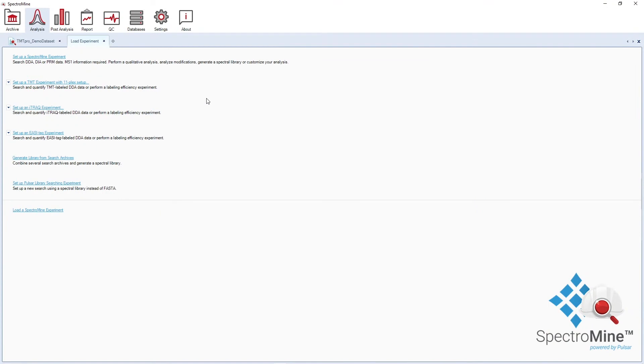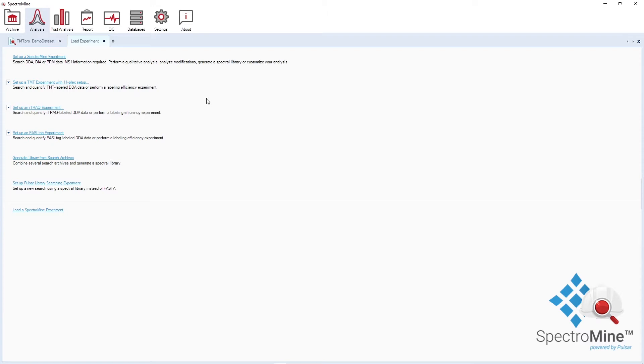SpectrumMine is a versatile software conceived to search any type of MS data and perform a variety of experiments. This includes searching and generating libraries from DDA, DIA, as well as PRM data with MS1 information. You can also perform isobaric label quantification, ILQ, and labeling efficiency check for isobaric tags.